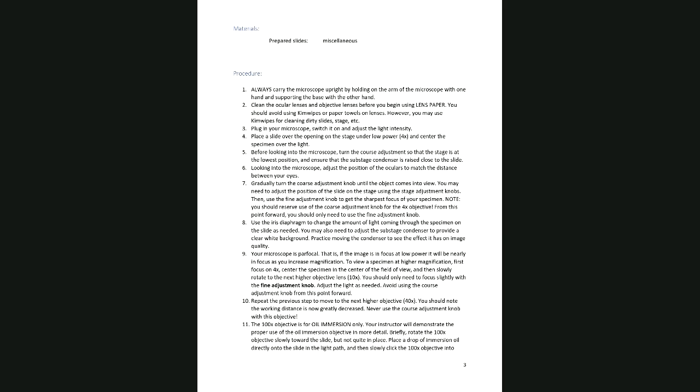You put the drop on the slide in between the high dry and the oil lenses, and then you slide the oil lens into the oil. Now, students are always worried, oh, but what if the oil lens touches the slide? Well, the oil lens is supposed to touch the oil. That's the purpose. If the oil lens actually hits the slide, you can't actually move the oil lens in place, then that means you were not in focus on high dry. So you have to go down to a lower power.